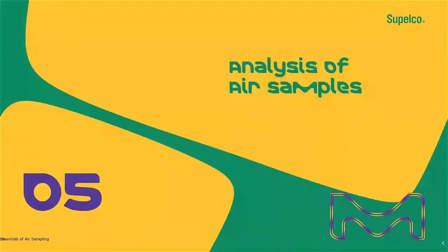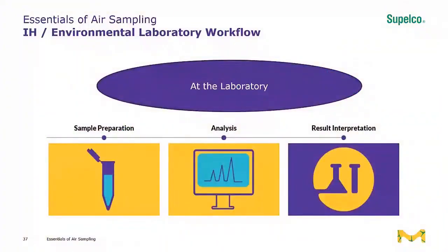The next process that will be discussed is the analysis of air samples, which occurs after the air samples have been taken, whether active or passive. The devices go through this analysis workflow. So what happens at the laboratory when they receive your samples?